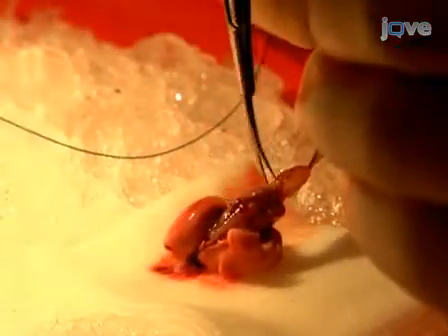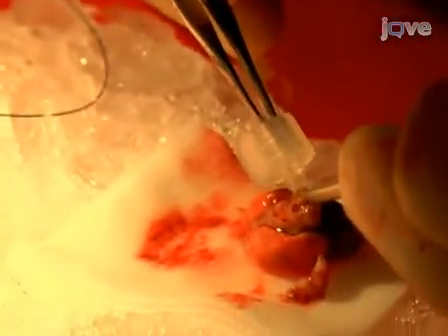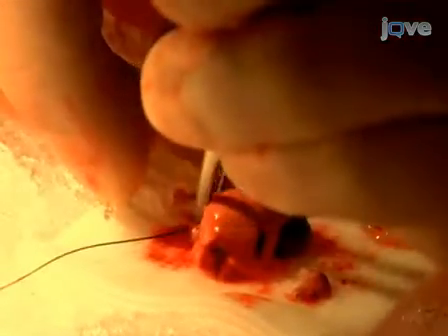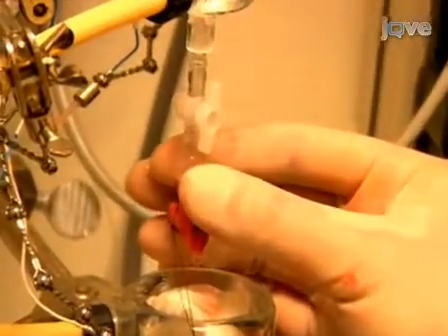Quickly identify the ascending aorta and dissect it from the surrounding tissue. Insert an appropriately sized cannula into the aorta, taking care to avoid inserting the cannula too far into the aortic root and interrupting obligatory perfusion of the coronary arteries. Secure the cannula to the ascending aorta. Then place the rat heart on the Langendorff apparatus without introducing air bubbles into the cannula.